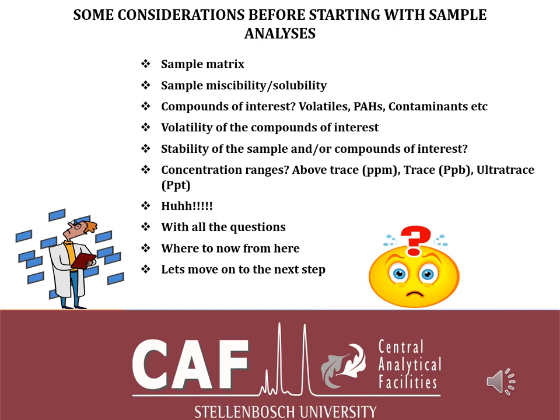You can call it something else. For me, ultra trace is anything between, I would say, in the ppt range, or maybe from 1 ppt to 1,000 ppt, or even lower. You can also regard it as ultra trace below ppt level.